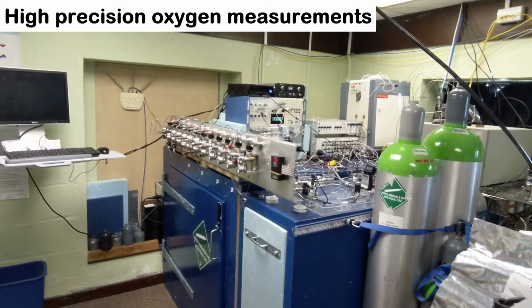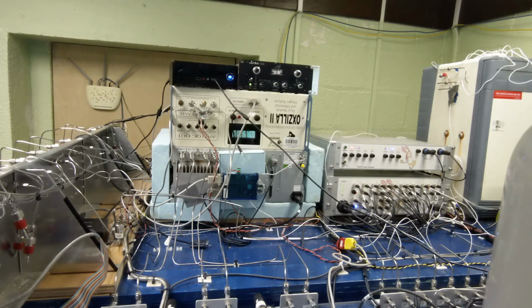Here we have a second measurement of atmospheric carbon dioxide. Once again, this takes advantage of the fact that carbon dioxide absorbs infrared light. But as well as carbon dioxide, this instrument can also measure atmospheric oxygen concentrations, which can be used to learn a lot about the carbon cycle, as carbon dioxide and oxygen are very closely linked through various anthropogenic and natural processes. We can quantify the amount of oxygen in the atmosphere using its reaction with a lead fuel cell.